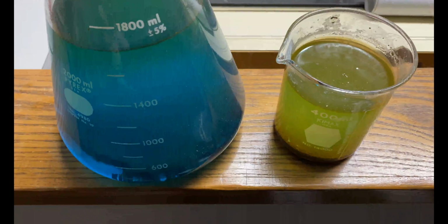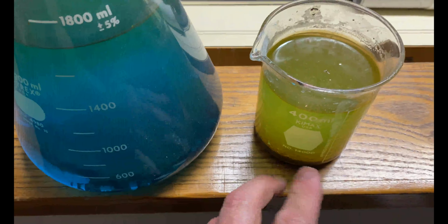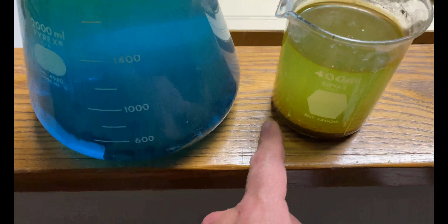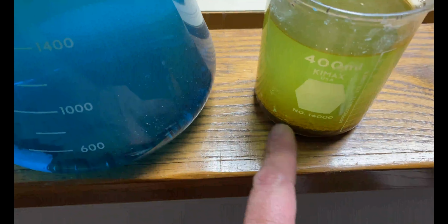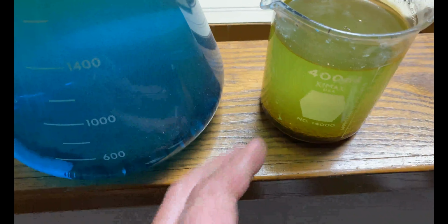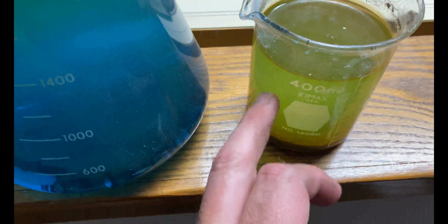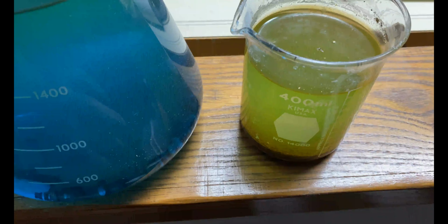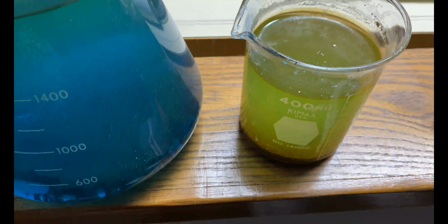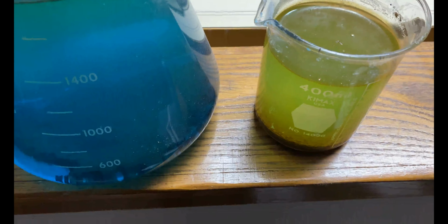Okay, after sitting for some time, I think it was about 2 days, you can see here we're getting green vitriol, and because there was an excess of iron in the bottom, it converted all of the blue vitriol to green vitriol. Unfortunately, you get other dirt products in there. You get rust and iron sulfide and other kind of gunky things.